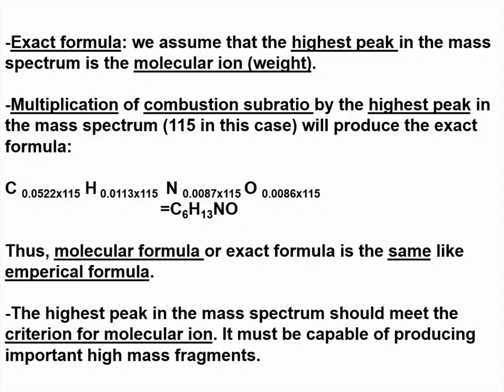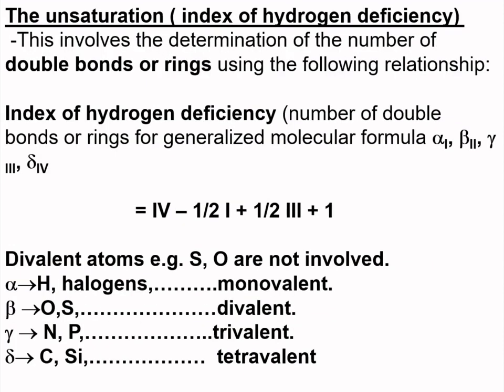However, the molecular ion peak of the sample should meet the criterion for the molecular ion, and can be used to explain the formation of important high mass fragments.